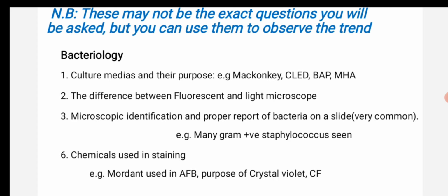For example, when we see some bacteria, we have to state their number, right? First, few, many. Next will be the gram reaction. Then their genus and shape: Staphylococcus, Streptococcus, and so on. So we have to follow this format. Many gram positive Staphylococcus, few gram positive Streptococcus.